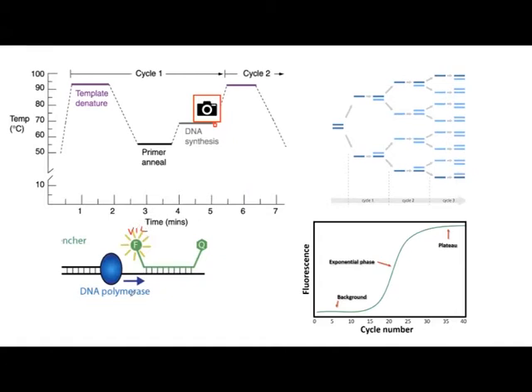Because after each PCR reaction, the Taq polymerase is going to break one probe molecule, so you're going to get one fluorescence molecule released. After one PCR reaction, you're going to get one fluorescence molecule, and here you're going to get 2 fluorescence molecules. So after each cycle, the fluorescence should go up one by one. Again, you're going to get a sigmoid curve like the SYBR Green. The only difference here is that you're going to use a probe, and this probe specifically binds to the DNA, and you can multiplex that.